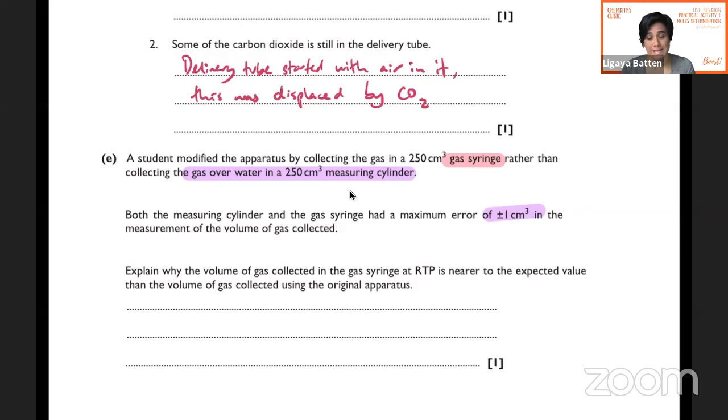So carbon dioxide is a gas that can dissolve in water, and that means that if we use the collecting the gas over water in a measuring cylinder, some of the carbon dioxide will actually dissolve in the water in the apparatus, because it's a soluble gas.